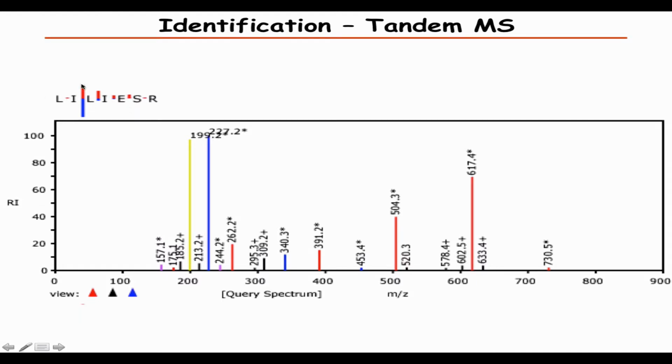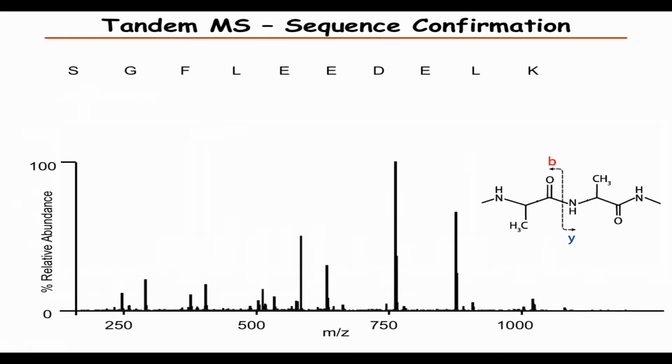So for this, the fragmentation between this isoleucine and leucine, we have a lot of evidence because we have both strong Y ions and strong B ions. So this is the whole point. And so the different strategies are either now, first we look at the spectrum and we have the sequence.